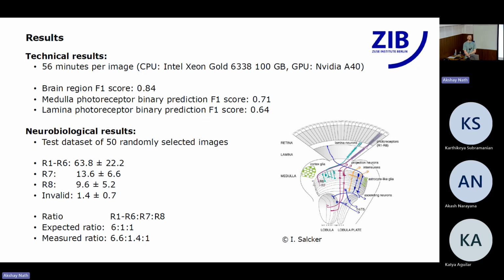Yeah, you're right. Well, for example, in the case of brain regions, since we do the prediction in 2D, we don't actually have only 20 images, we have 20 times the amount of slices. So I think at the end we ended up with 10,000 slices or something pretty high. But in this case, yeah, we do have only 10 images, but the network also performs some data augmentation.